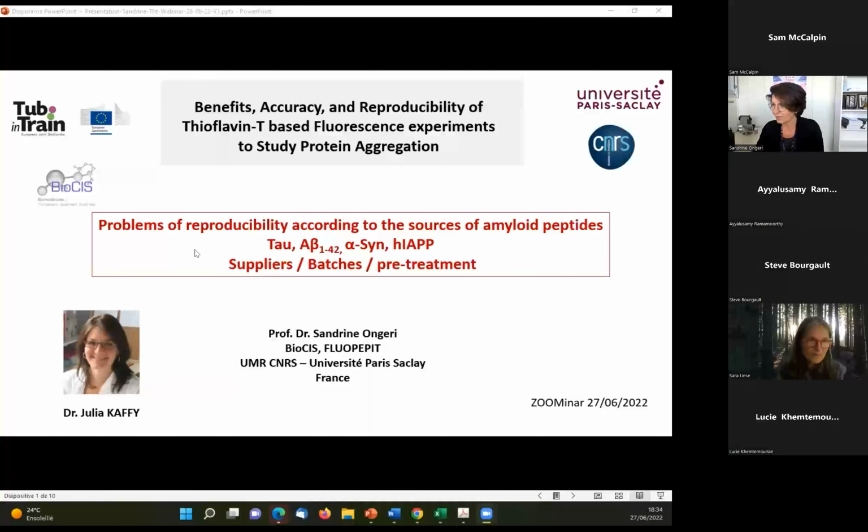So I will show you the issues of reproducibility we have according to the sources of amyloid peptides. We have a huge problem with tau, A beta, alpha synuclein, and IAPP according to the sources of the amyloid peptides.